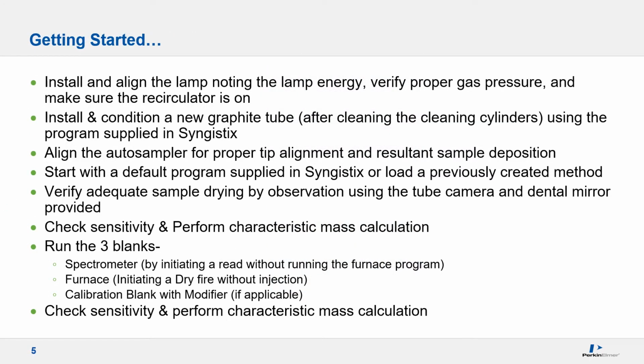Before we begin to discuss how the STPF concept is incorporated analytically, we need to ensure that a sound scientific procedure has been developed and implemented on a routine basis to create consistent performance. Items such as cleaning the contact cylinders to maintain consistent heating of the tube and removing a potential source of background and vapor phase interferences.